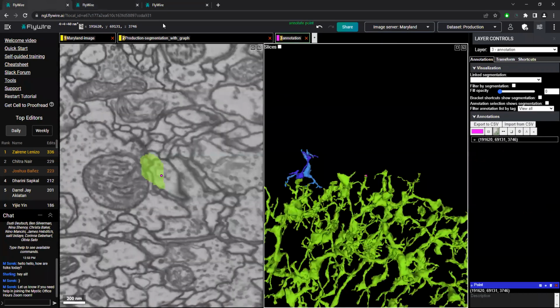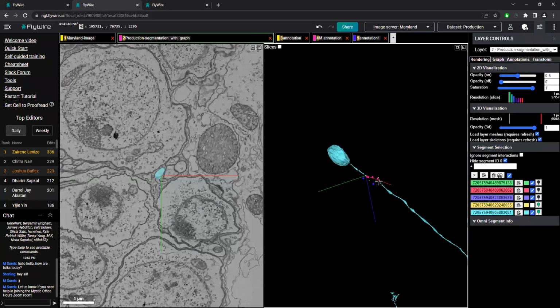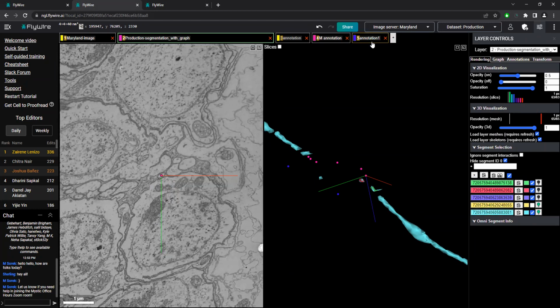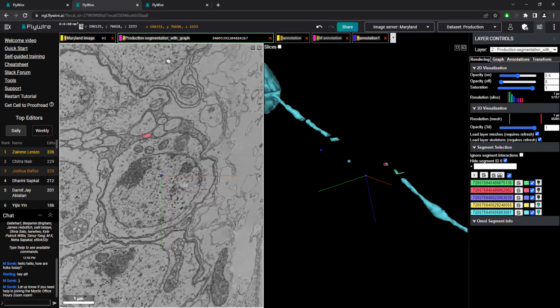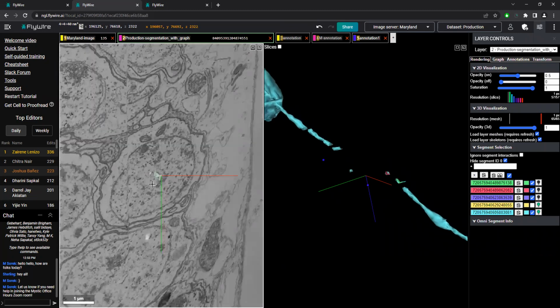Yeah. So the other thing we can use, especially in your case here, is, let me turn off that annotation. No, not this one. Let's say that we have a large structure near where we were working that's pretty identifiable, and then all the junk in between that's hard to see what's going on.